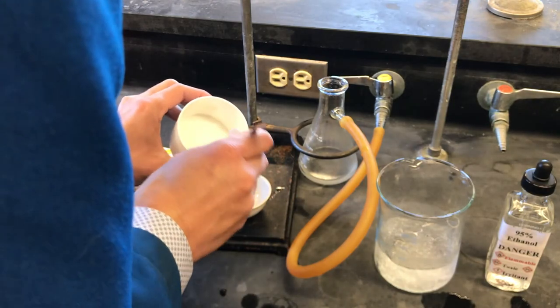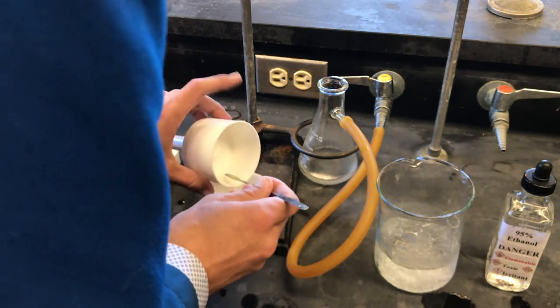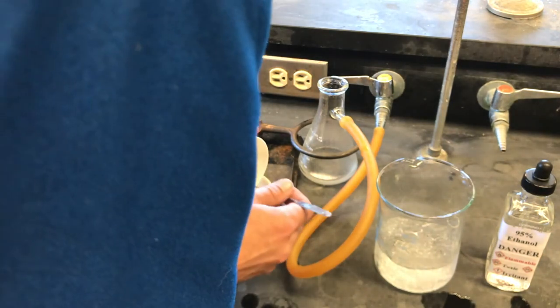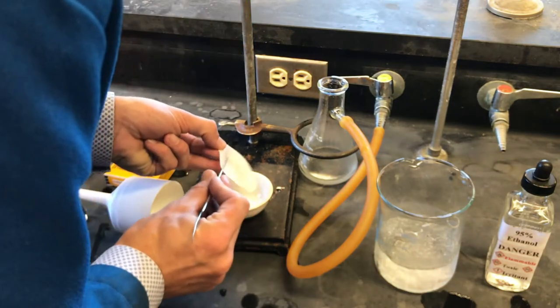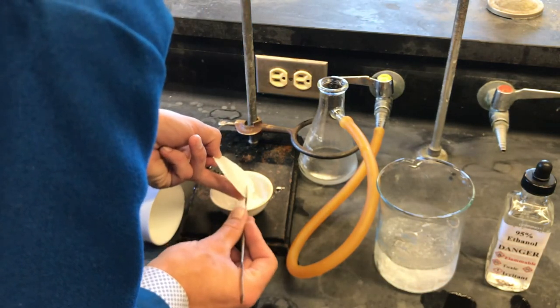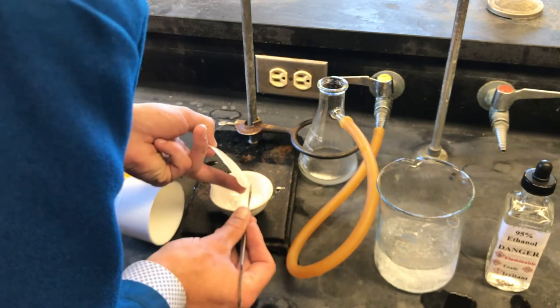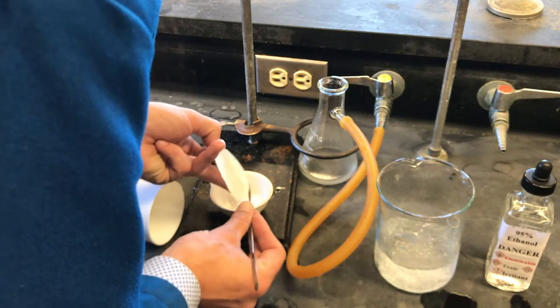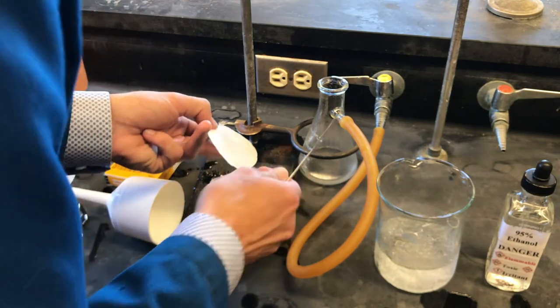Now, as carefully as we can, we'll transfer all of the alum to the evaporating dish. It's important to note that this is a major source of loss. Any product left behind in the Buchner funnel will reduce our overall yield calculated at the end of the experiment.